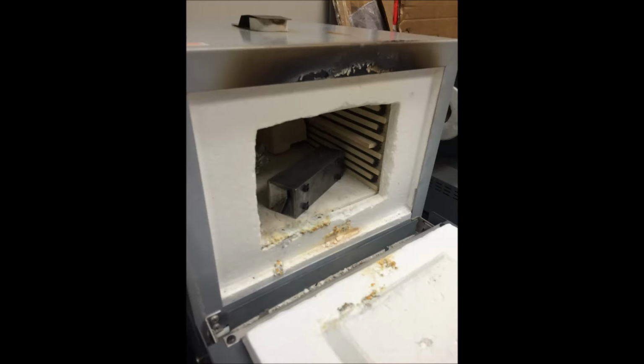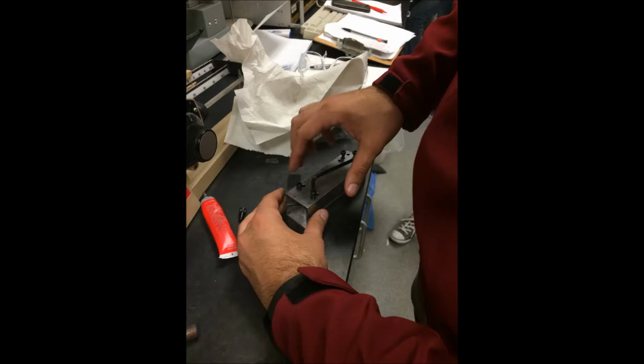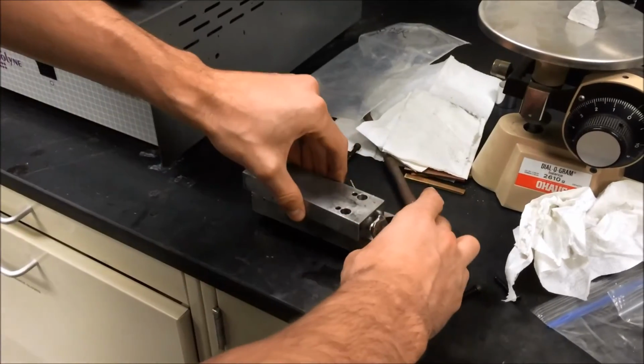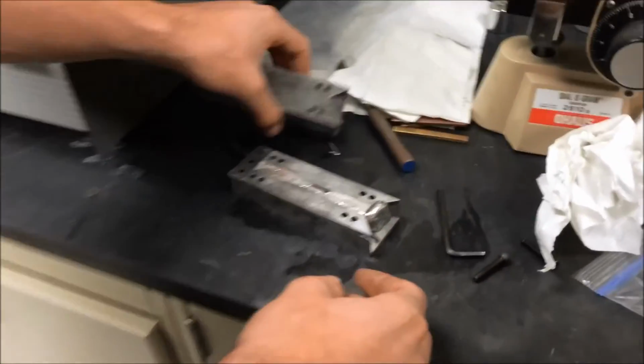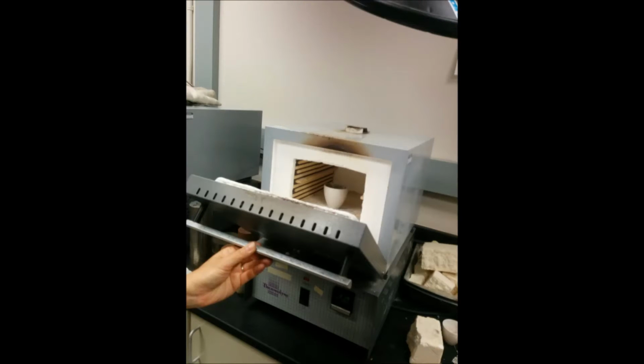The die used in this experiment is made of steel, and areas where tin will be poured into the die are lubricated with carbon, which serves as a releasing agent. Chunks of tin solder are placed in a crucible and carefully tonged into the furnace held at 286 degrees.